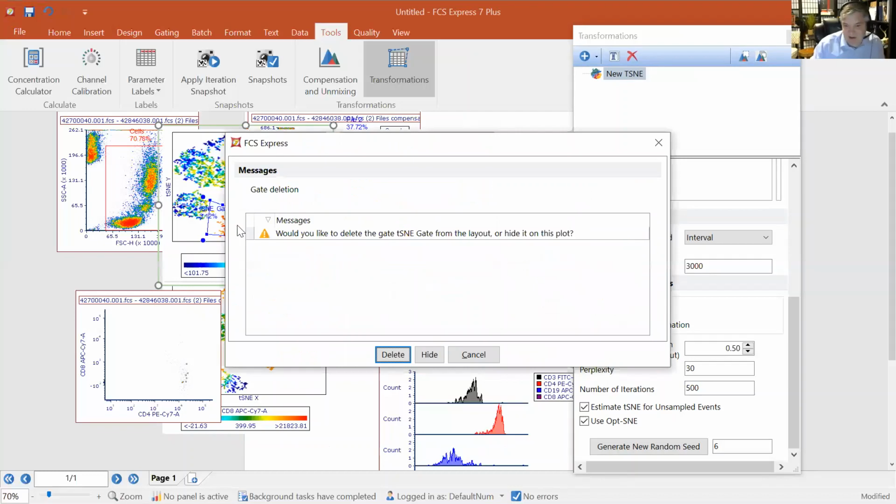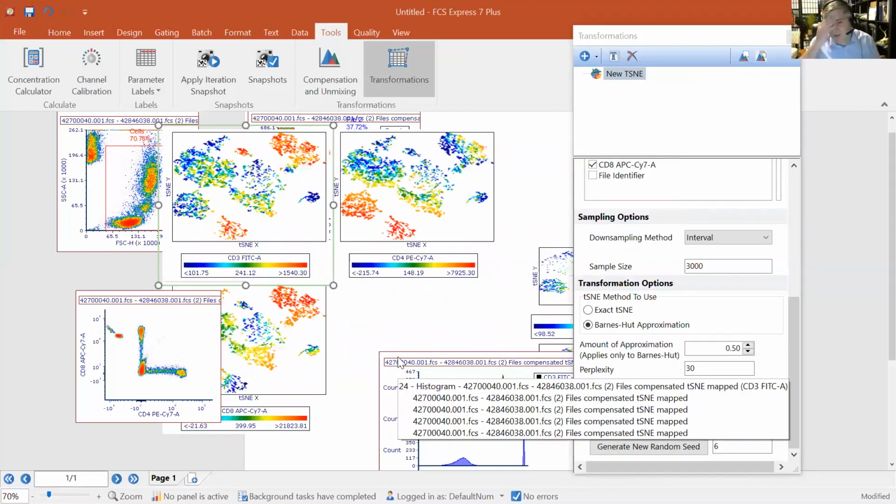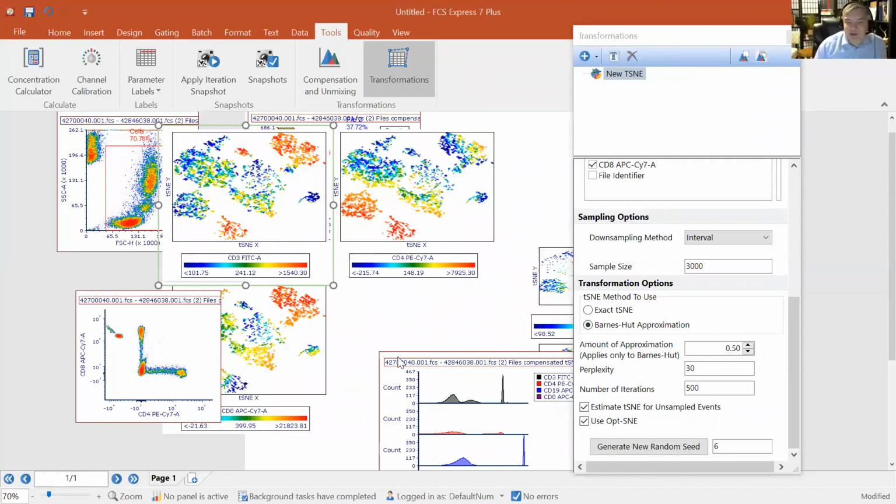Yeah, it's a really great question, because going back to the beginning of the presentation, I mentioned over and over again that the clusters, just because they're close to each other, doesn't really mean anything, right? But what is close and what is far? I'm looking at this cluster here. Well, maybe there's actually two clusters there. So generally when we talk about things in this clustering space not having any meaning, it's generally like global distances, right?